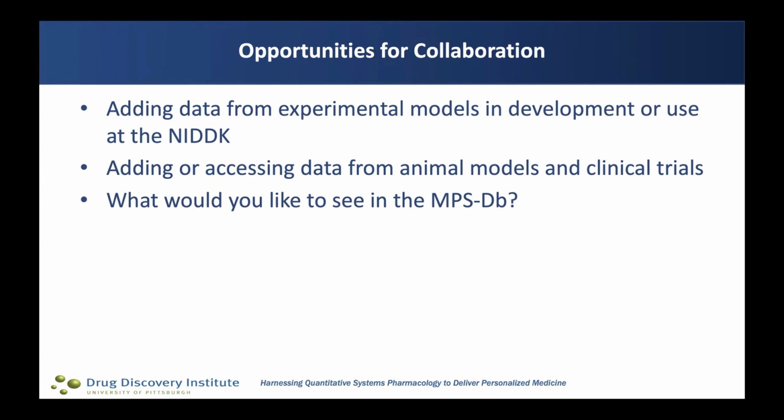And there is a lot of information in the database that hasn't been released publicly yet, because individual scientists are working on studies and creating studies and uploading data. At the end of that process, once they've completed that study and they've got all the data in the database and they sign off on the study, then the study is typically made accessible.